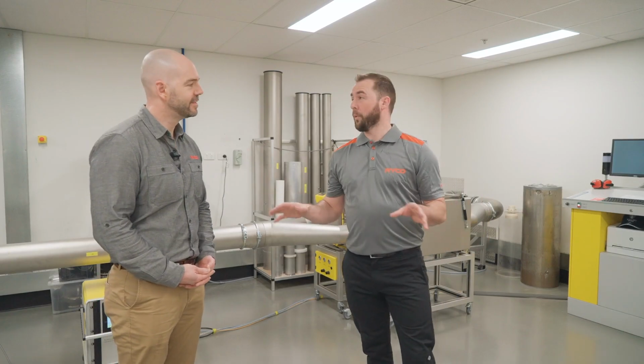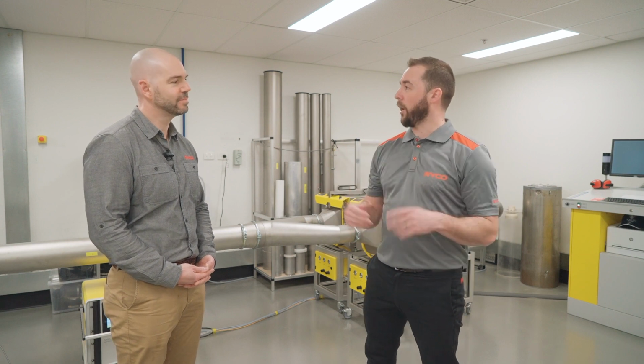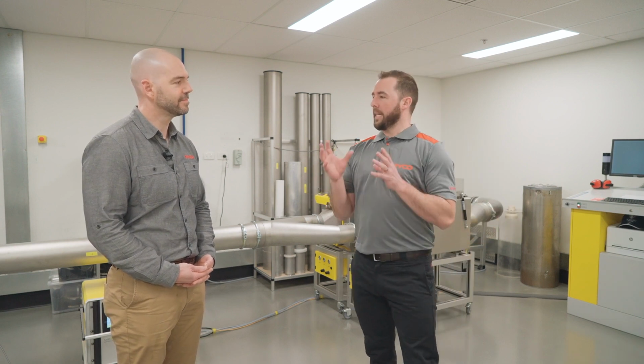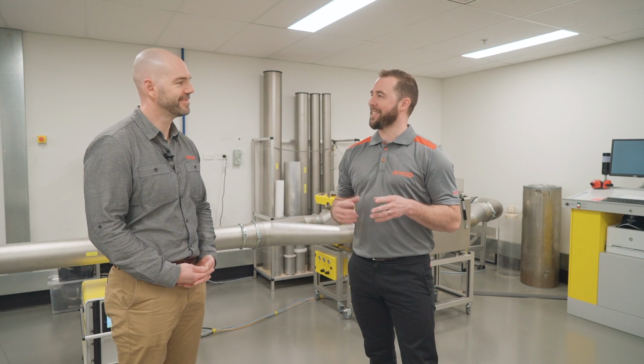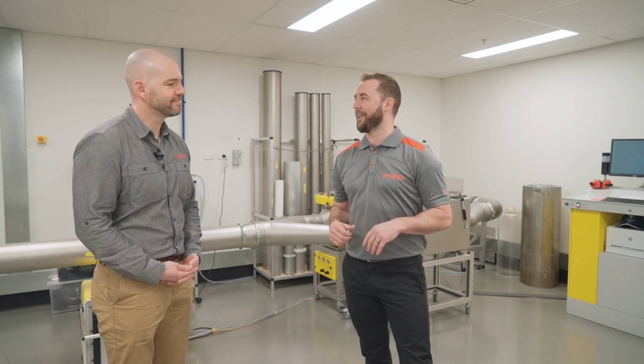Now, Alistair, in this particular room, we've got a lot of equipment around us, and they're specifically set up for testing air filtration. Next door, we've got the wet lab used for any kind of wet filtration. Now, let's talk about dust. How and what kind of dust do you use to test your air filter mediums in this particular lab environment?